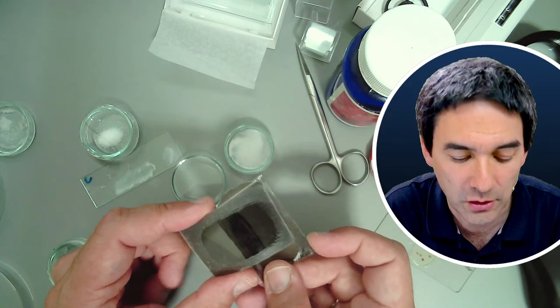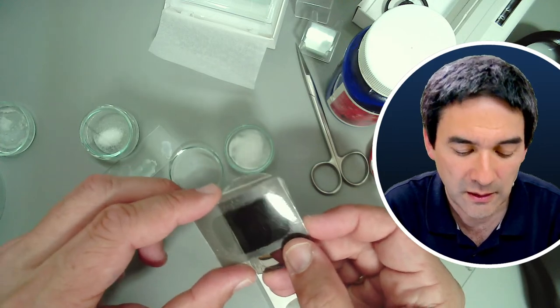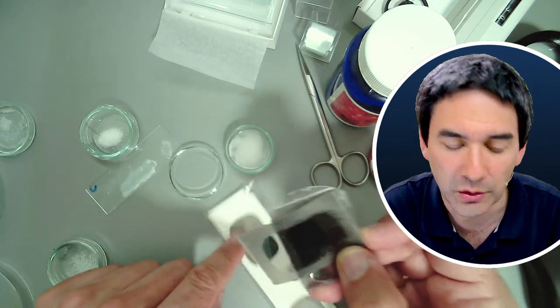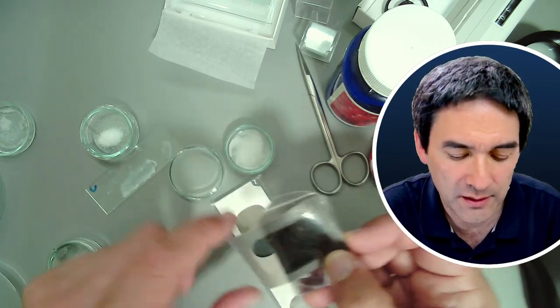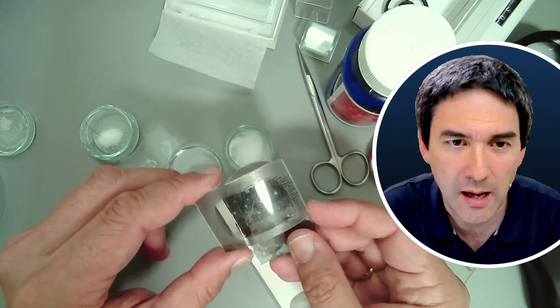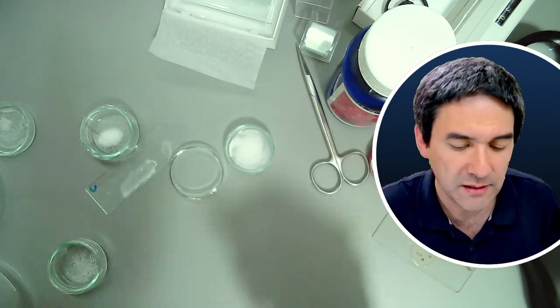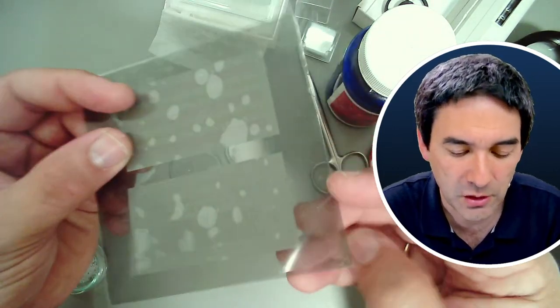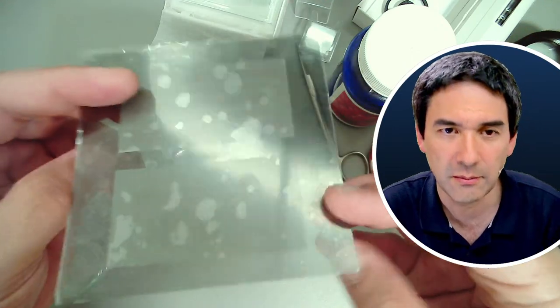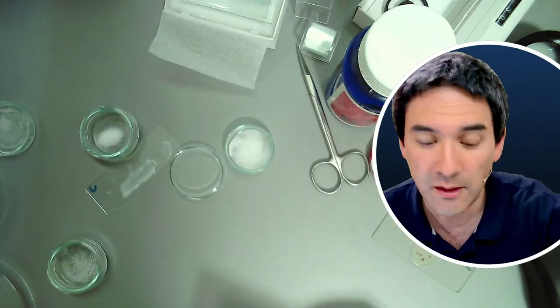you need a little bit more trial and error with those polarizing glasses until you find the right orientation. I've also had some polarizing glasses where it didn't work because they're different standards. I think the standard here is called Real D or something like that, and this kind of works. But before you experiment with those polarizing glasses, I would probably recommend getting yourself a linear polarizing filter like this, simply because it's a little bit more stable and a little bit thicker than those here. I think that's easier to use, but it is possible to use those too, and I have done so in the past.